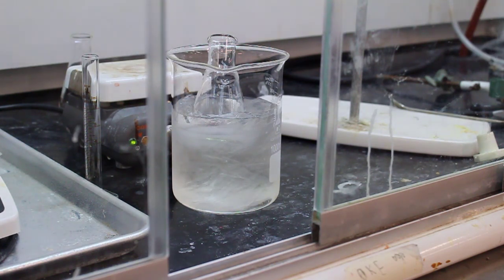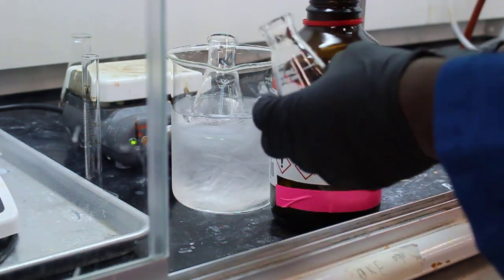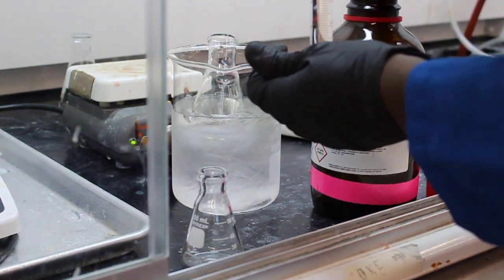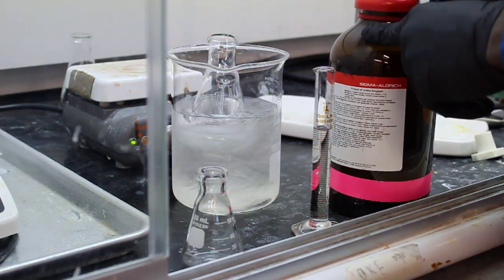Once fully dissolved, they removed it and let it cool to room temperature, then placed it in an ice bath to recrystallize. They're also chilling some absolute ethanol simultaneously along with the bromotriphenylmethane product in ethanol. We'll see why the cold ethanol is needed when we use the vacuum filtration system.